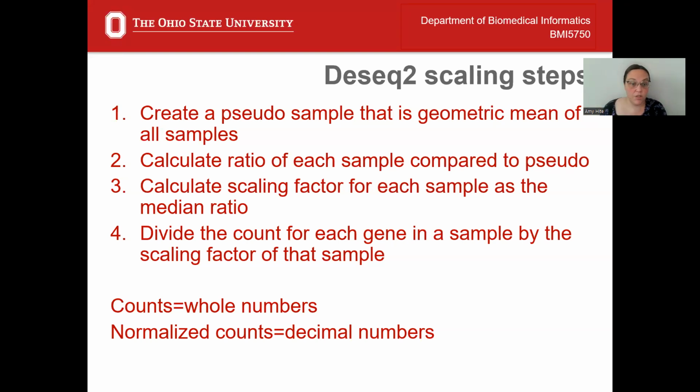They're either normalized already, or maybe they've been log transformed like our Xena data that we have to deal with a little bit later. So if you see decimals, question it. Is this really counts? Do I need to do something to this data set to bring it back to counts?